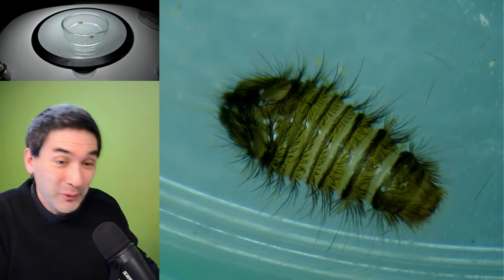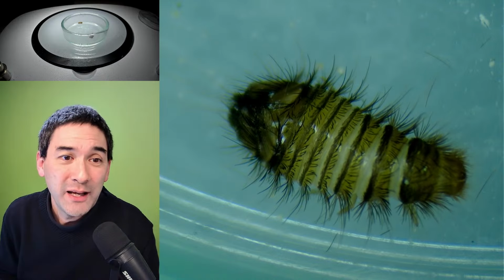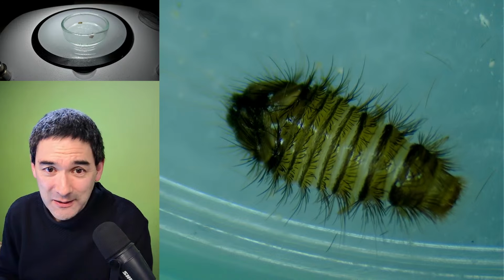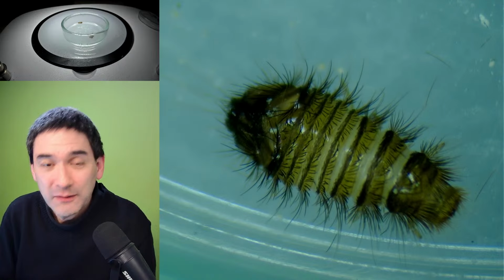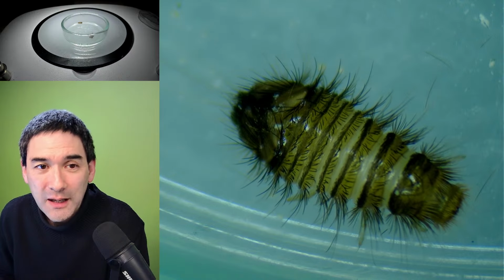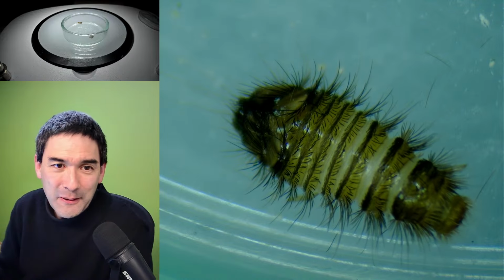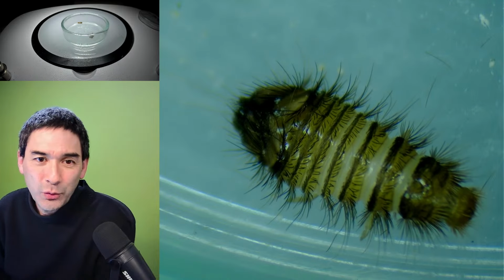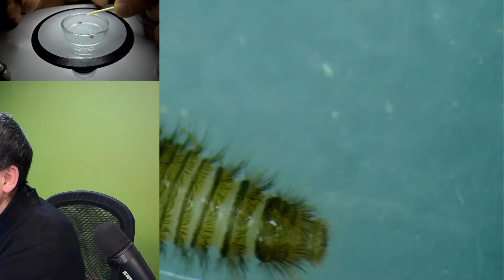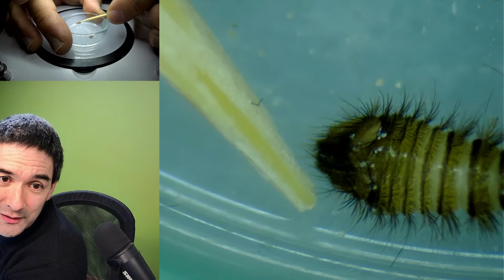This guy has been going around since October, and every time I put it under the microscope, it doesn't seem to like light. If you've not seen it yet, I'm going to show you something else. Interesting, do you see those tiny little hairs as well? I want to show you the back of this little animal. I'm going to carefully touch it with a toothpick. Let's see if it still responds.